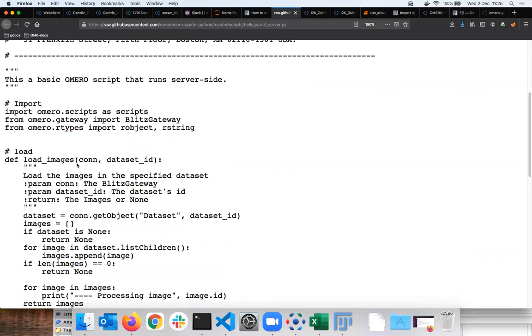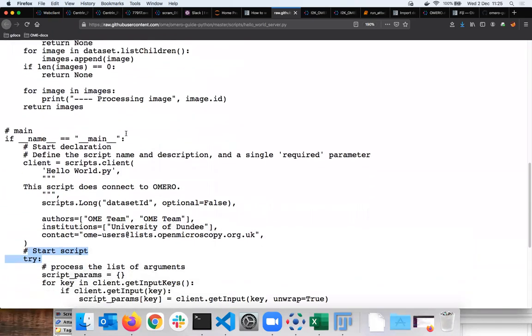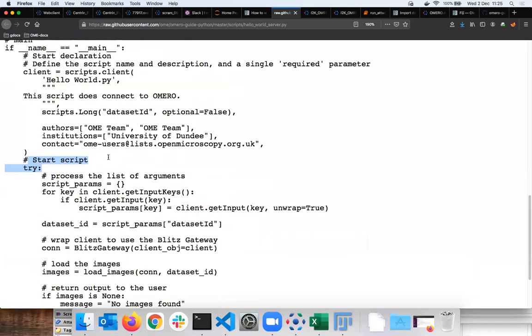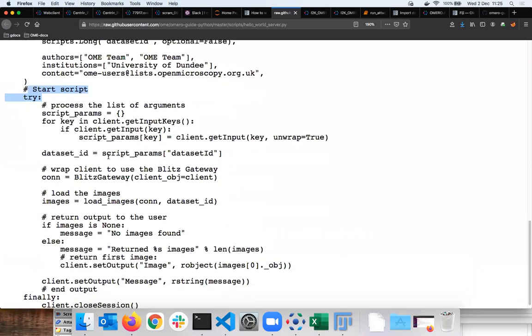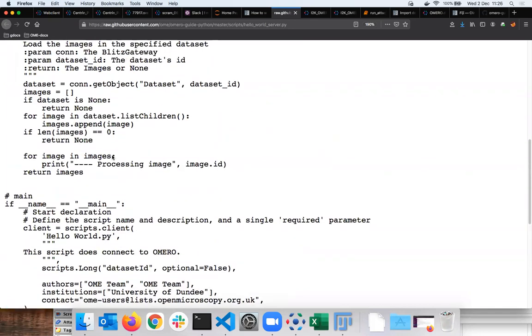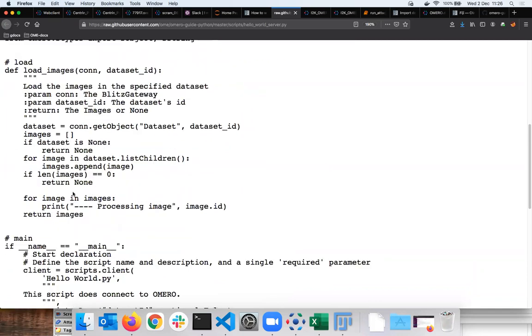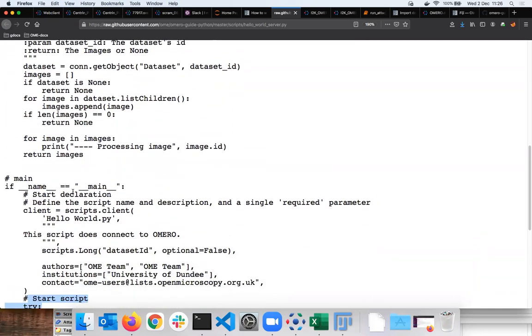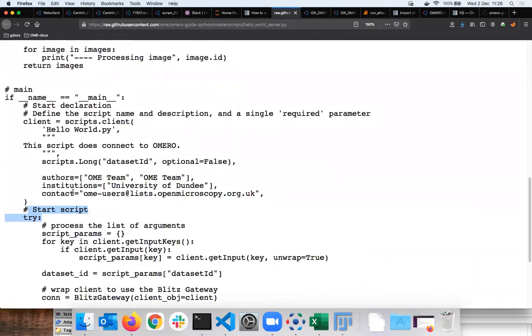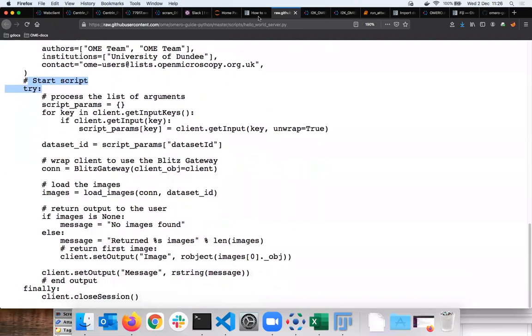It's basically a pretty easy matrix to follow, and you can simply manipulate the code here and stick your own features into that matrix of the form of the script, such as highlighted here.